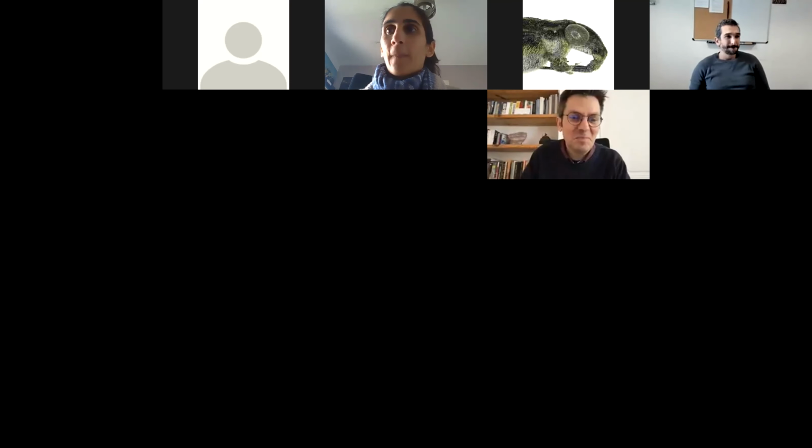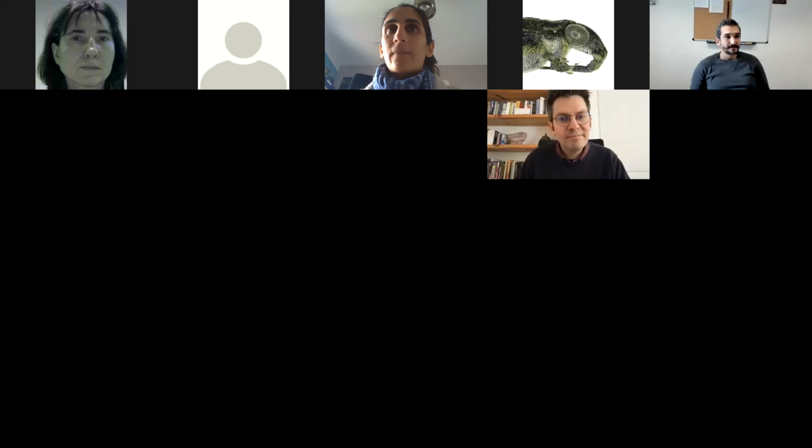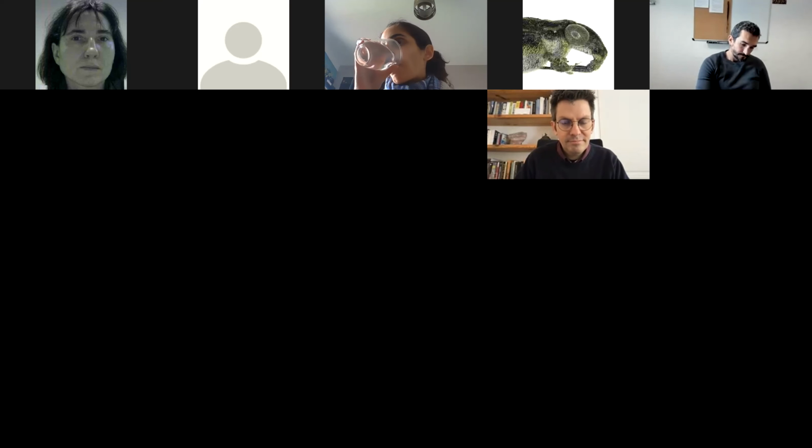Muriel? Yes. I have a question related to how we can help you. I'm obviously interested in smFISH, but as you mentioned, to start with that, we need to develop something for doing the several rounds of hybridization. And how can we help in that?